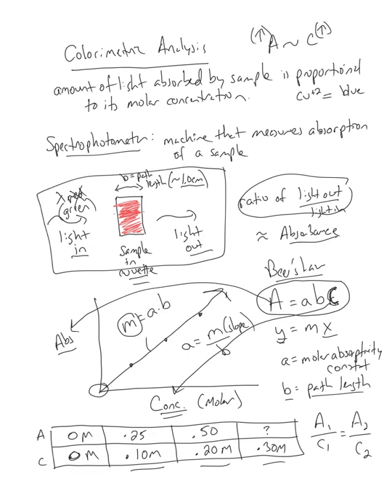So based on this knowledge, I don't even have to worry about knowing the A and B value because they're always the same for the material that we're using. So therefore, we get this beautiful proportionality, just like what you see with a lot of gas laws. If I know the absorbance and the concentration in one set, and I know the absorbance or concentration of a second set, I can always predict the other value. So in here, I could already complete the question mark that I circled, without you even knowing much math.